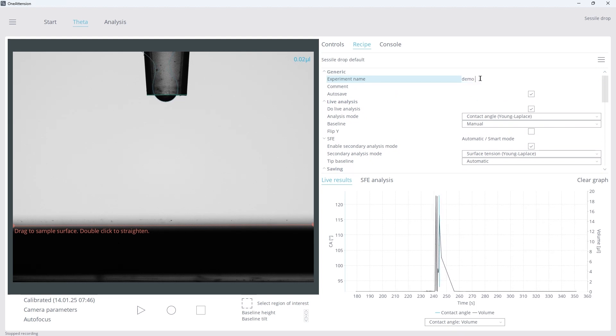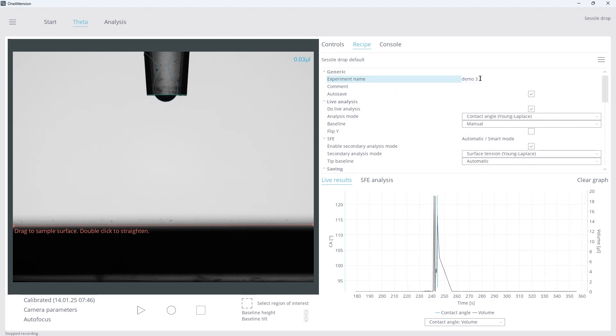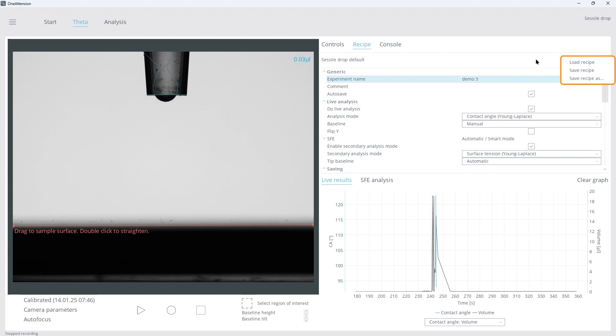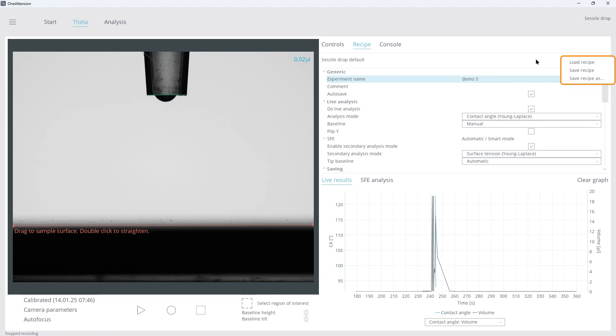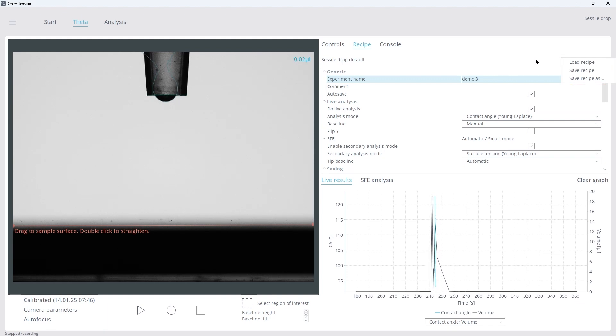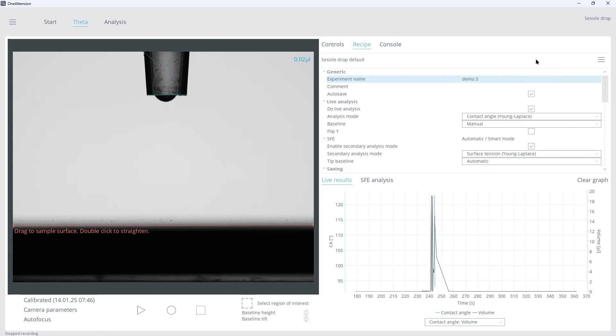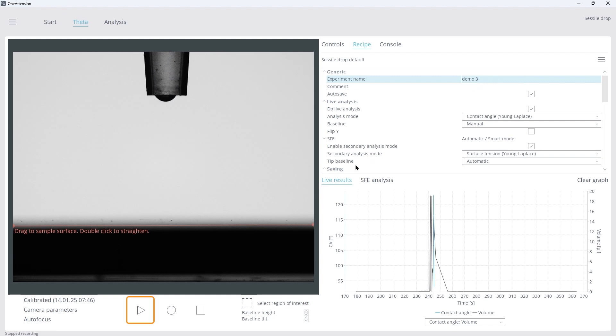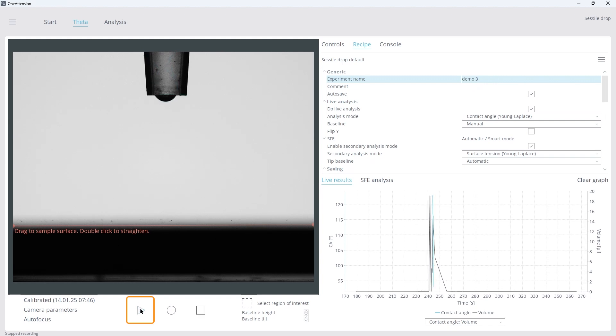Name your experiment. The hamburger button is used to load or save recipes, but today we are using the default recipe. When your recipe is optimized, click Play on the bottom left to start.